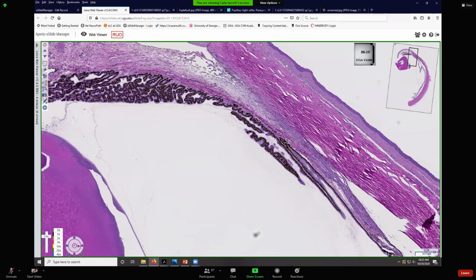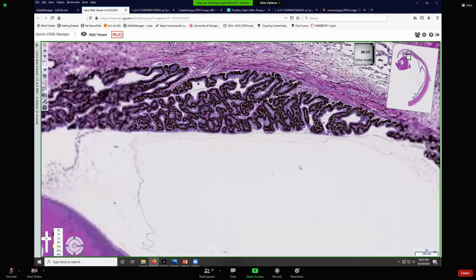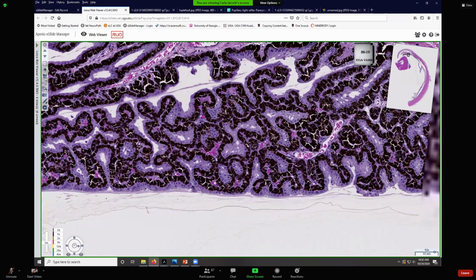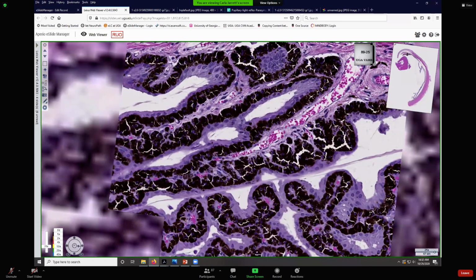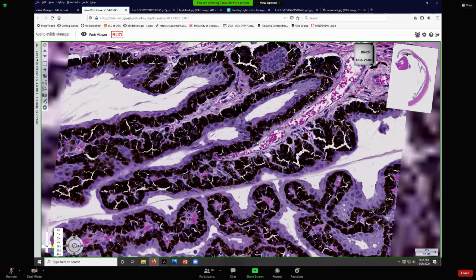Okay, so we looked at the ciliary body, the ciliary processes. Now, one of the main things these ciliary processes do is produce the aqueous humor. So you can see these blood vessels going up inside these processes, and that's going to get a real good close apposition with the ciliary epithelium. These capillary beds have a specialized endothelium with a discontinuous basement membrane, so they're leaky.